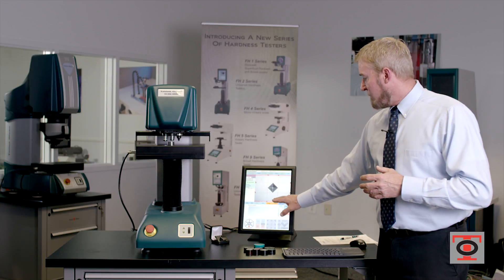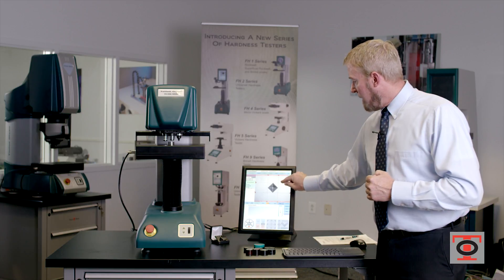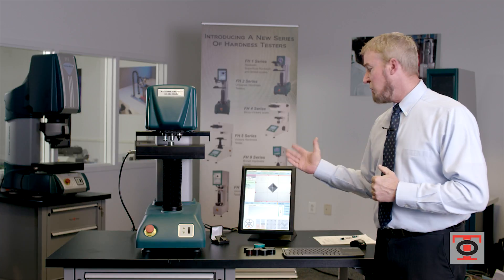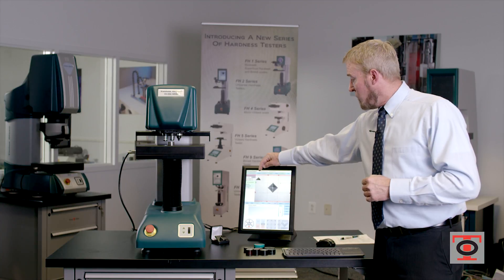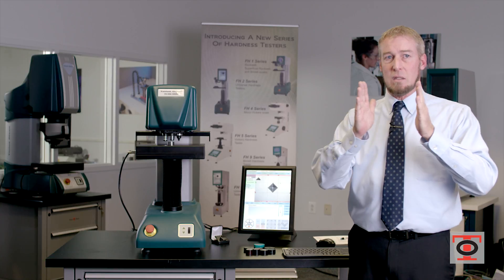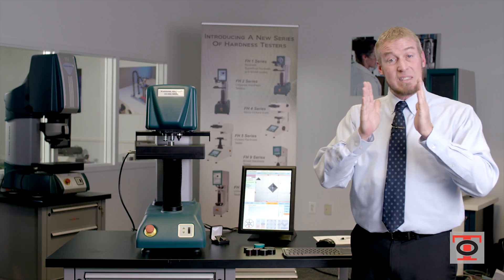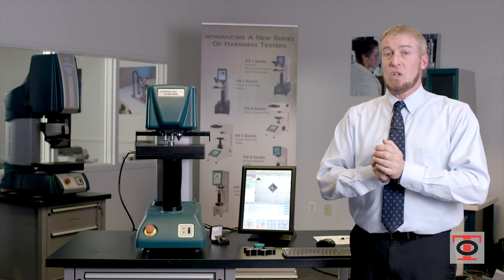You have the ability of touching either one of these lines, and what it will do is bring up an enhanced image of each one of these points, showing you exactly where we're measuring from when you're using the machine. So I highlight this line here, which happens to be the top green line, and you'll see over in this corner an exploded view of what is actually doing the measurement. Going back to the microscope — when you use a microscope, you're using two lines and placing them at the end of the indentation. There's a big question of whether you should measure from the inside of each line, from the center of each line, or from the inside of the left and the outside of the right — it really is machine dependent.